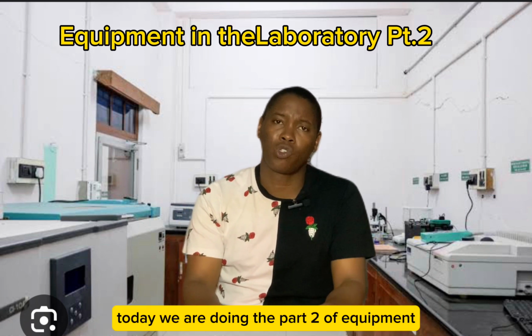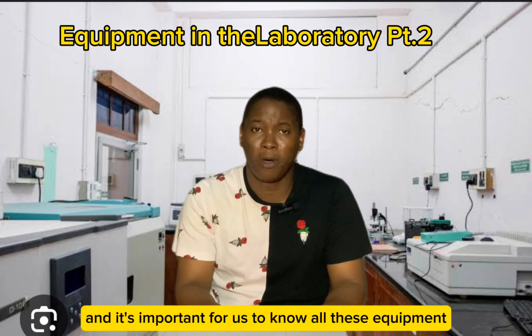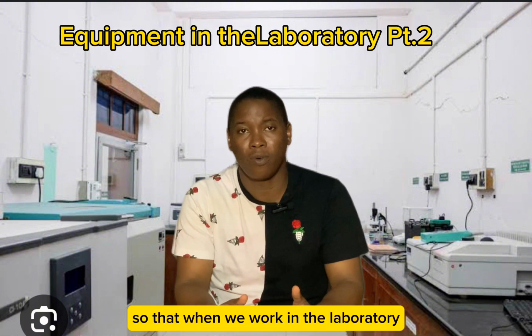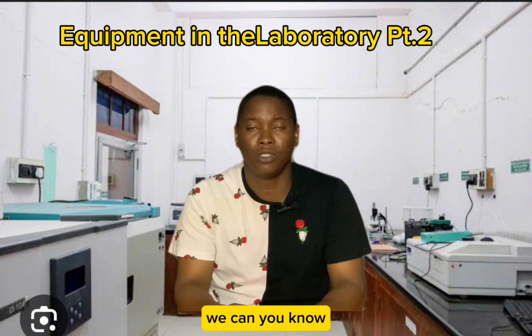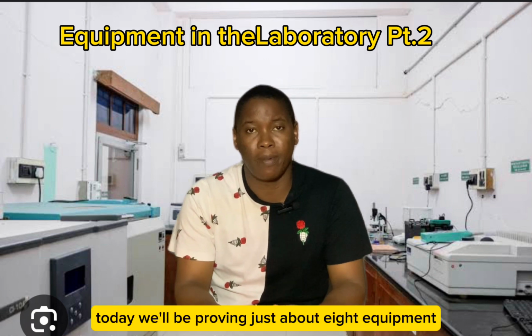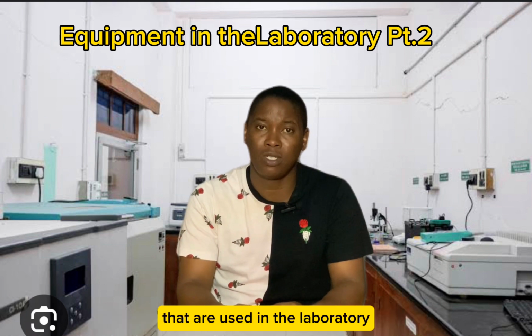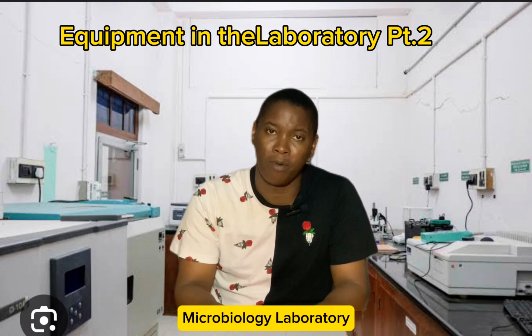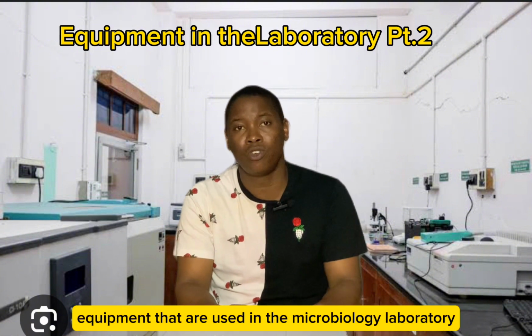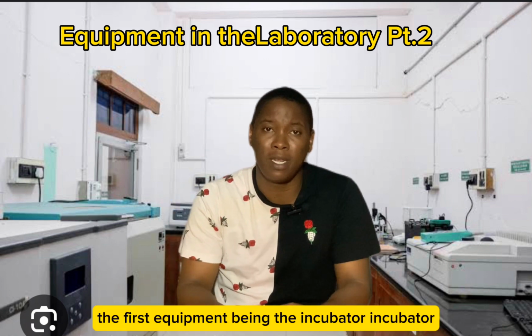Today, we are doing part 2 of equipment that are used in the microbiology laboratory. It's important for us to know all these equipments, what they look like, and their functions, so that when we work in the laboratory, we can get conversant with these equipments and use them very well. Today, we'll be previewing just about 8 equipments that are used in the microbiology laboratory and what they are used for. The first equipment being the incubator.